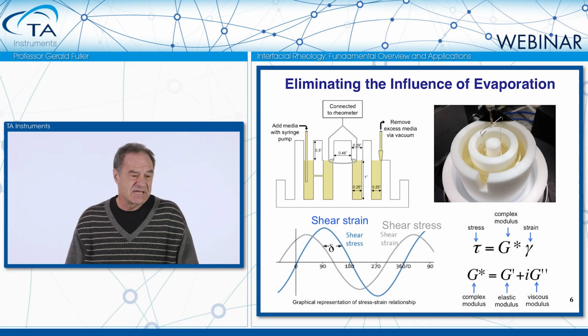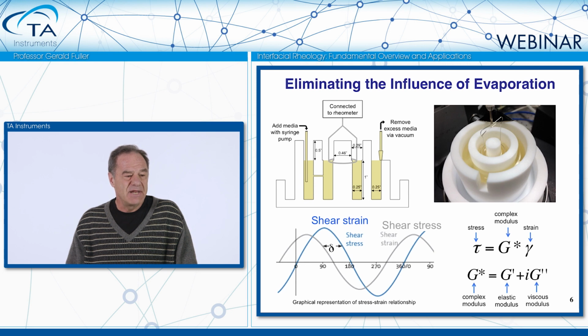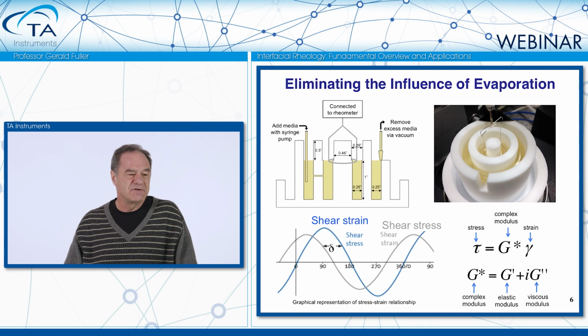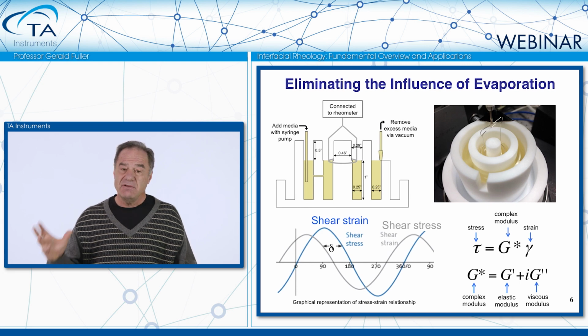And you can see the schematic on the left here where we pump media in, suck it out, but there's a communicating orifice between the two regions.